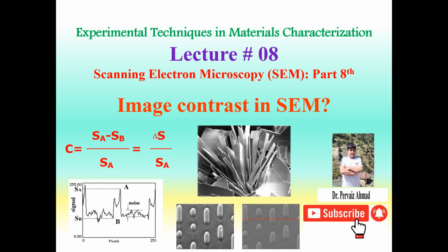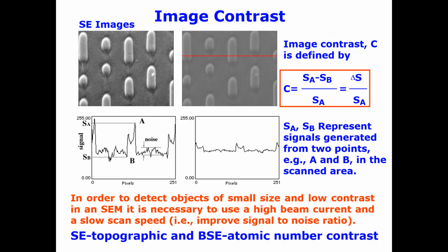Dear students, welcome to Experimental Techniques and Material Characterization, lecture number 8. In this lecture, we will continue our discussions on scanning electron microscopy. This is part number 8, the last part. In this lecture, we will discuss image contrast in scanning electron microscopy. So let's proceed towards today's lecture.